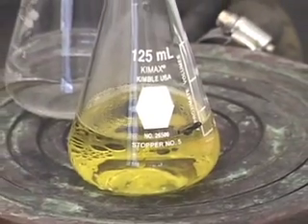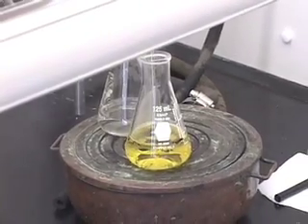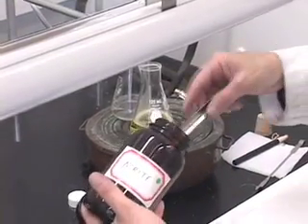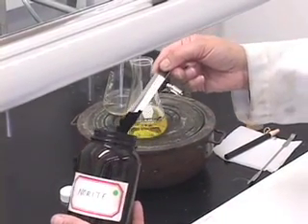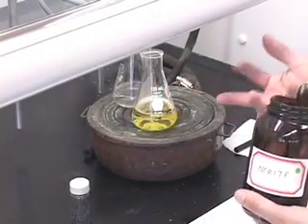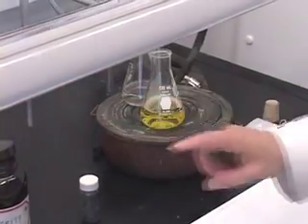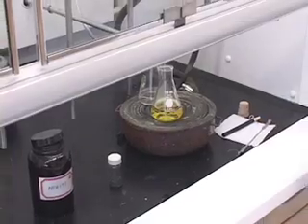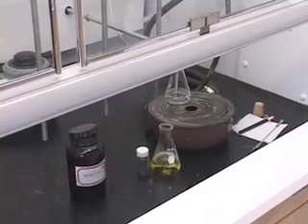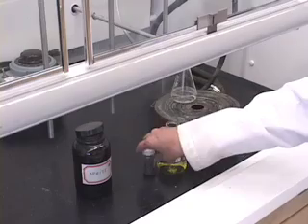To remove the colored impurities, we have to add norite. Norite is solid, finely powdered charcoal. We want to add norite to remove the colored impurities; however, you should never add any solid to a boiling solution. So you want to bring it down, cool it a little bit, and then add norite. We'll take it off the steam bath and let it cool.